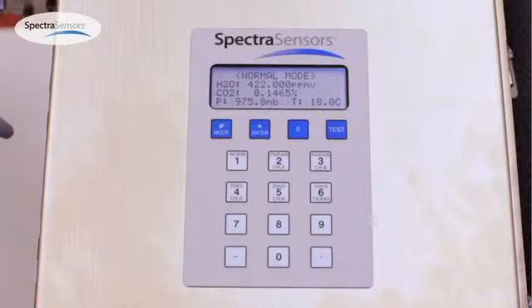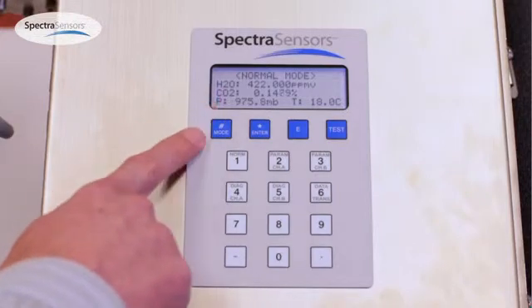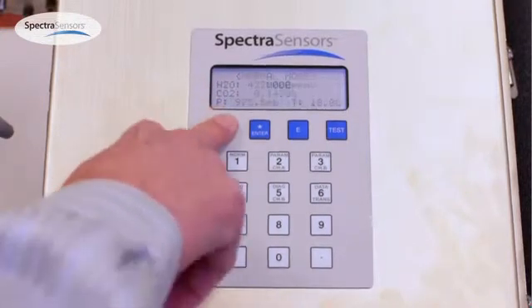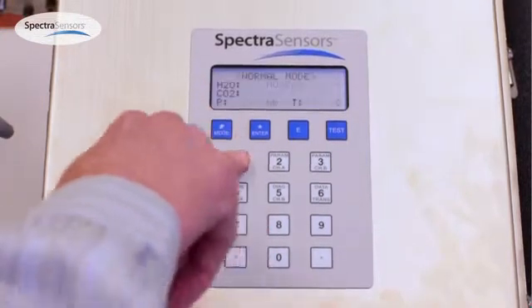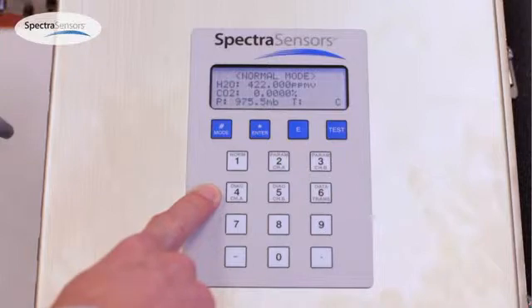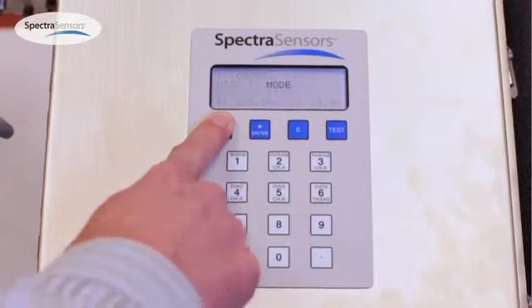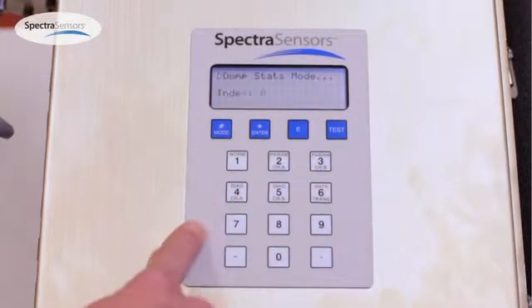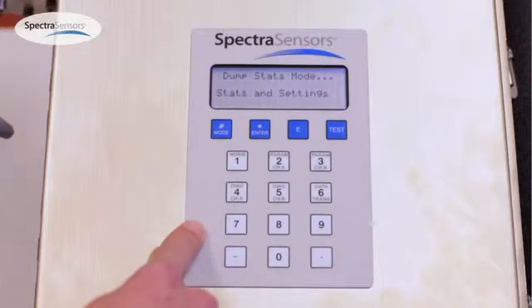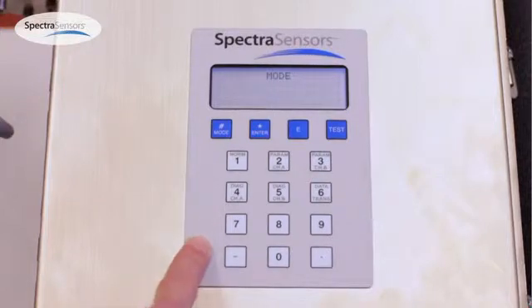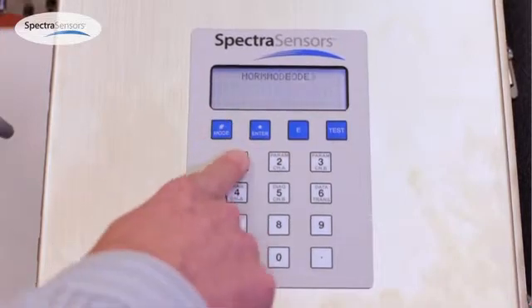So for a channel B data dump, to get a normal mode operation, if you're not in normal mode, hit pound one, and that's normal data. And to get a data download, hit pound six. And then once completed, return the analyzer to the normal operating mode, which is pound one.